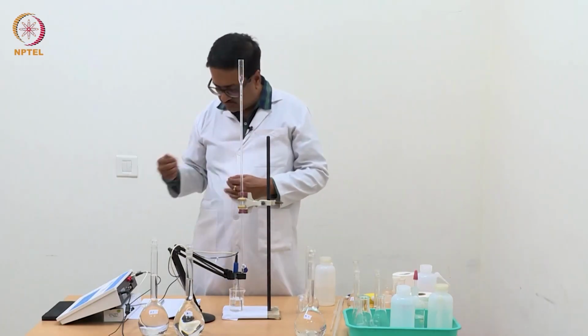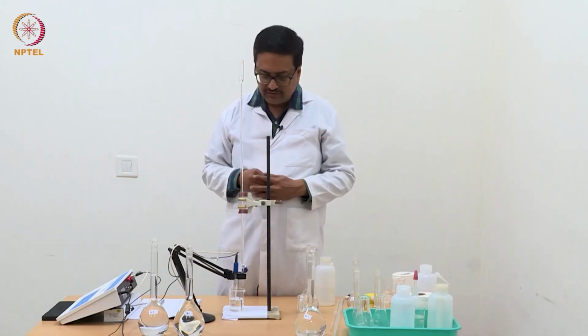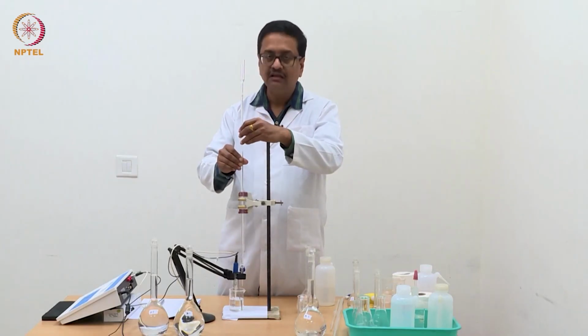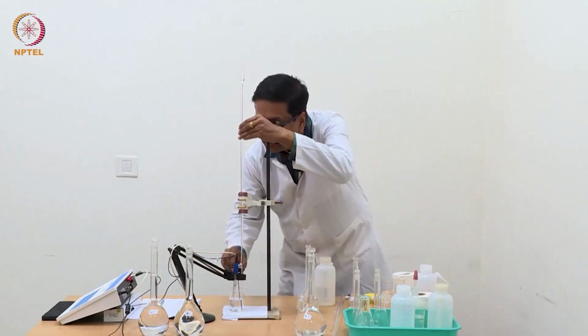So we should continue taking 3 or 4 more readings so that the pH crosses 10 and then the pH does not change with addition of more and more NaOH in this solution. Then the S-type plot will look nice.